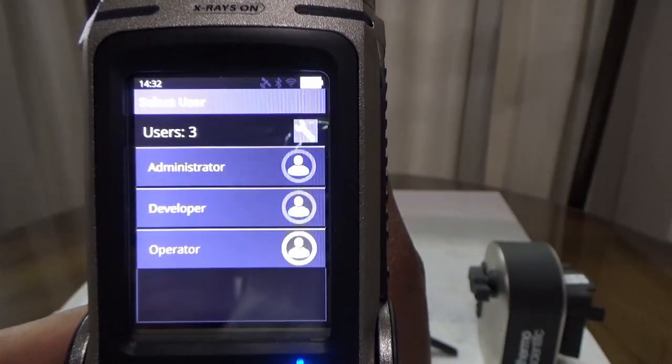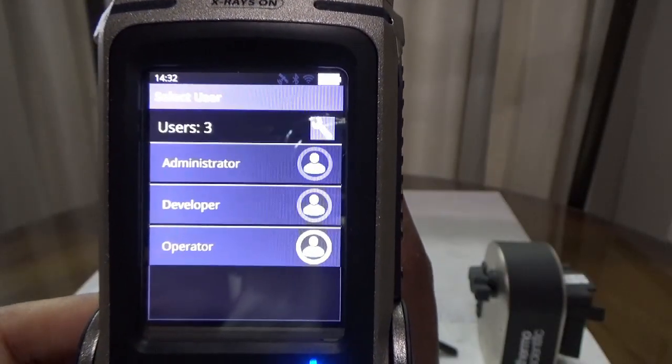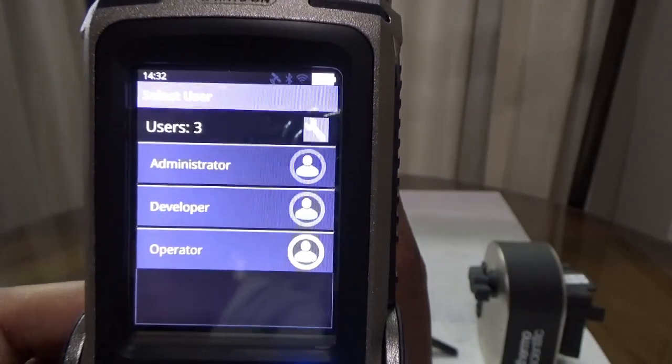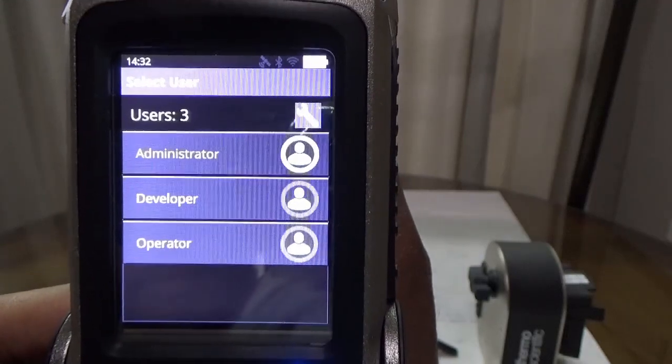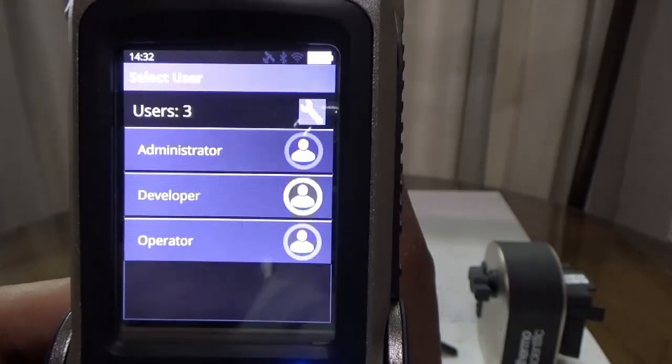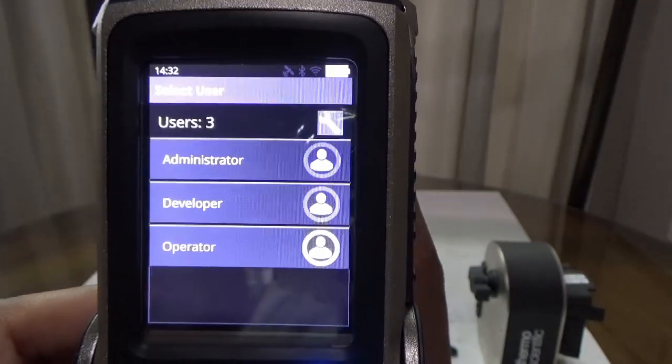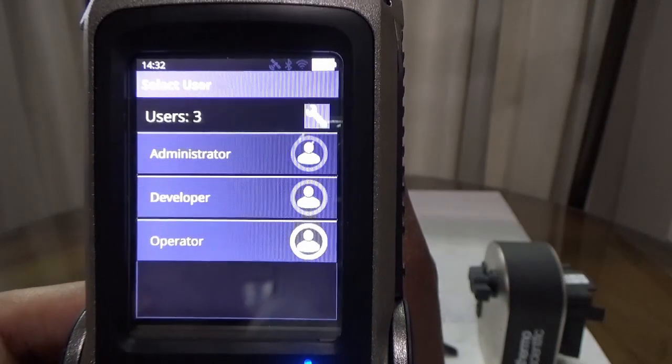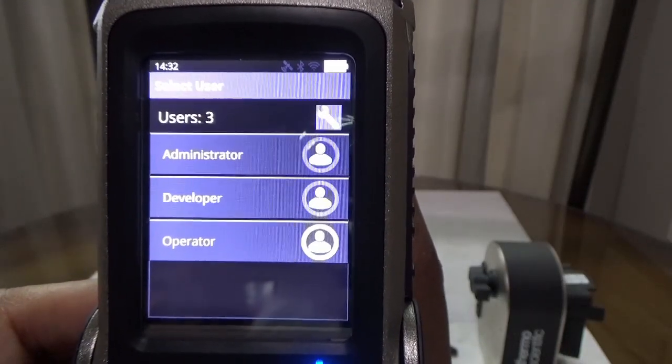IONIC-X has three user access levels: operator, developer, and administrator. The operator level user may only generate data records and sync data to a computer or networked archive destination of choice.